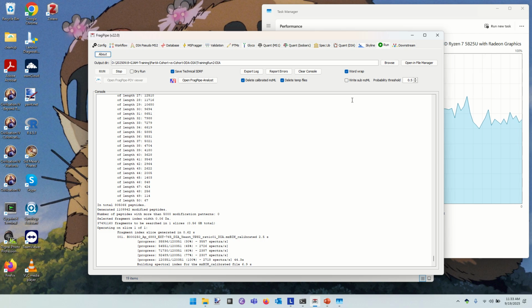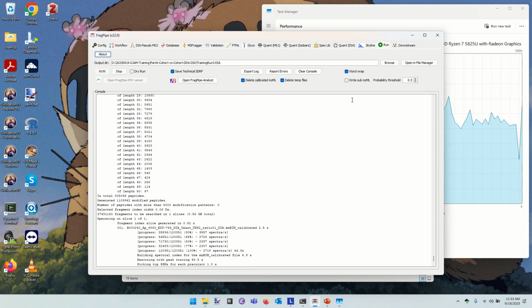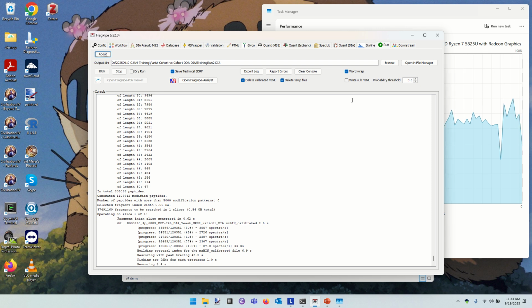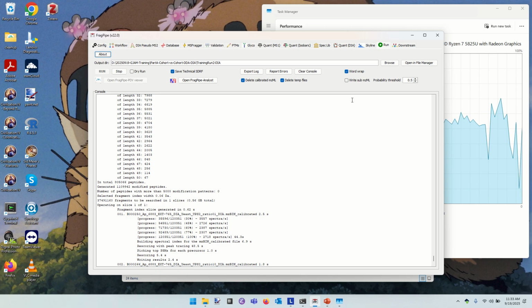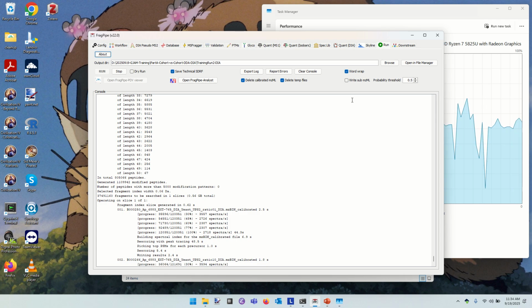In DIA MSMS, each MSMS represents a set of peptide ions that are co-fragmenting. So for our individual MSMS, we're not trying to account for everything we see in this MSMS with a particular peptide. Instead, we expect that multiple peptides are sharing this MSMS.